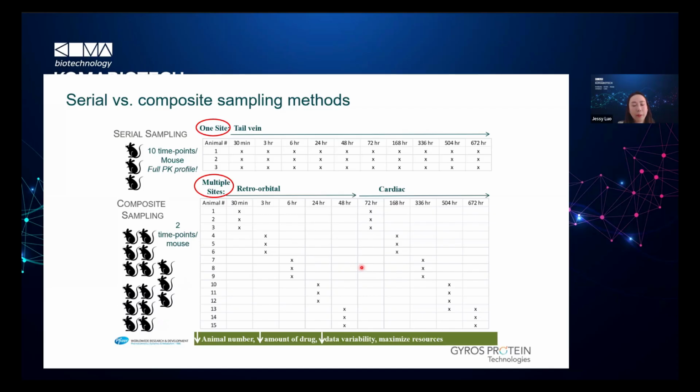But this will also benefit those drugs that are quite costly, like gene therapy or cell therapy, where the manufacturing cost is quite high. Then we could also reduce the sample needed. As well as those reagents that are quite costly, then you could also benefit from this.